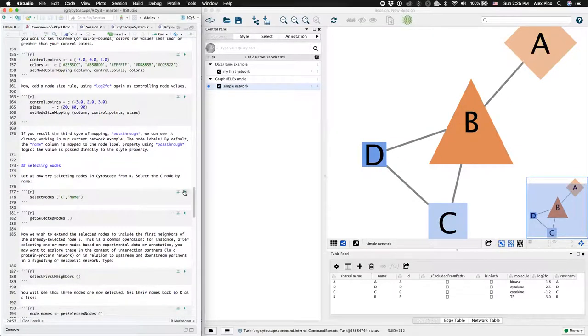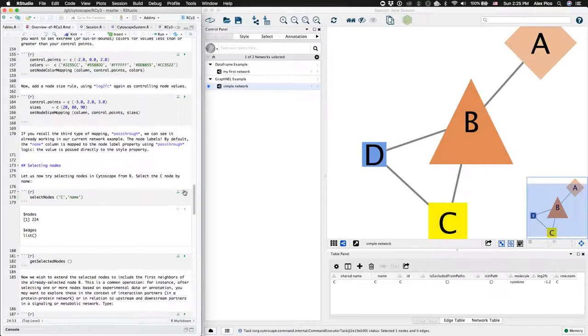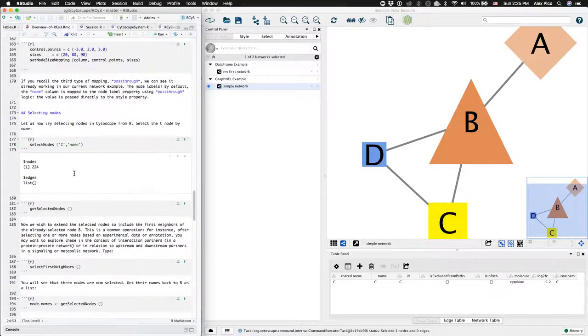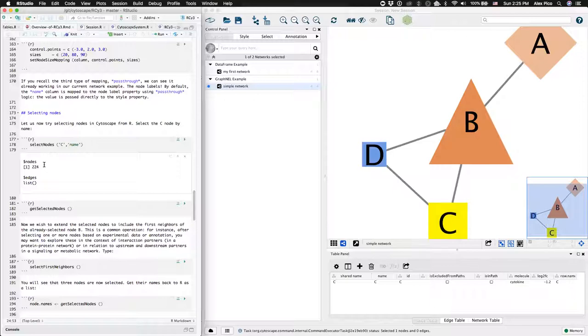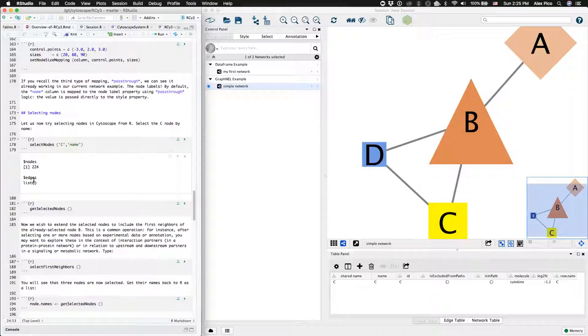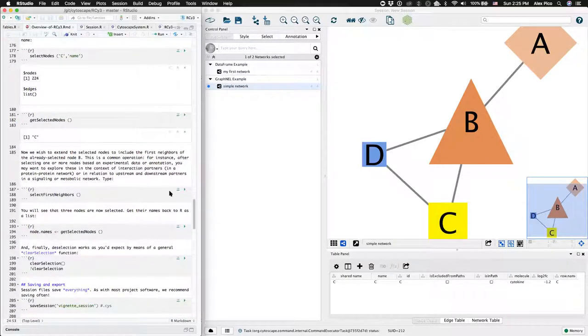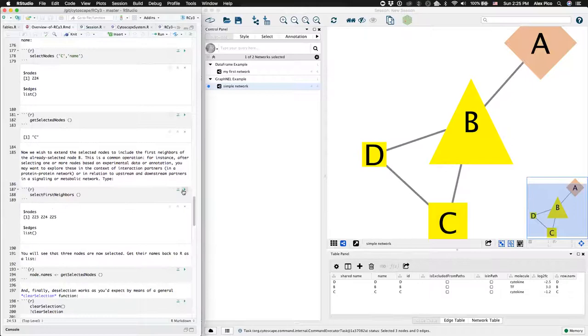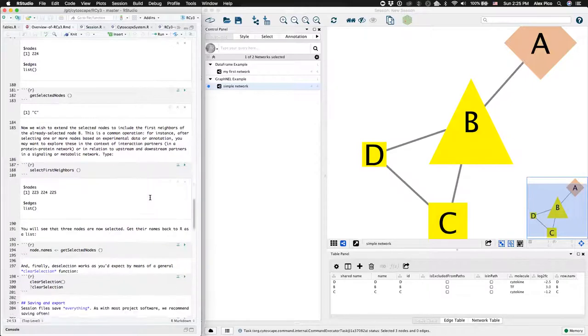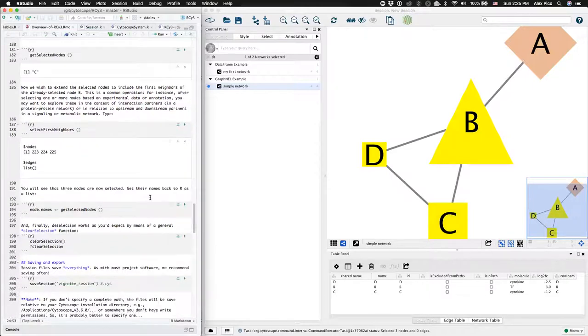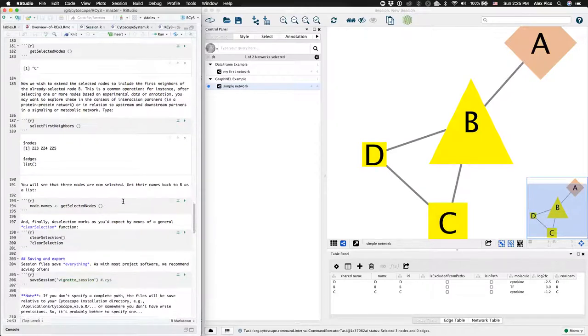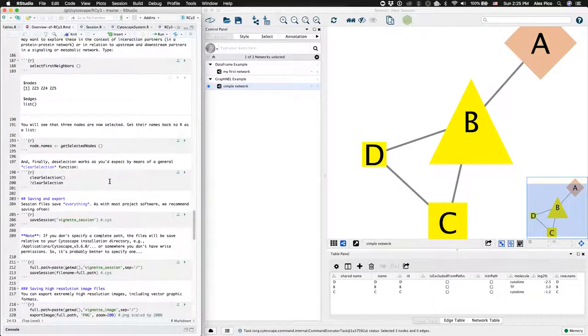You can select nodes, and the default return is an object that includes a list of selected nodes and selected edges. After the function is completed, you can also ask for the name of the selected nodes. You can select the first neighbors of selected nodes and get their node names as well.